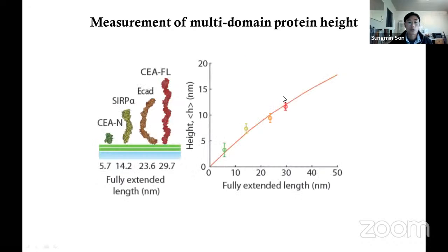Okay, so far I've been telling you about the data of synthetic protein measurements. So, here are the real proteins. I modified the tip of these proteins the same way to label the protein tip, and the measurement looks qualitatively pretty similar.